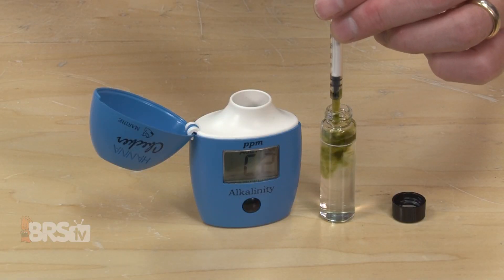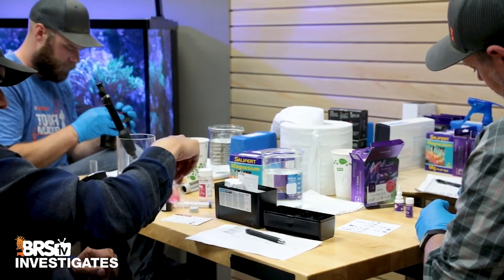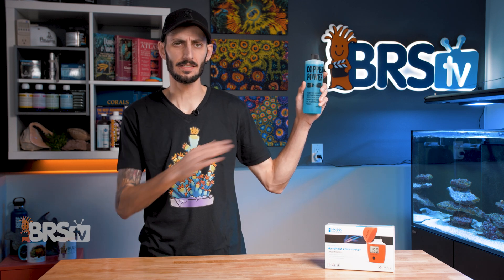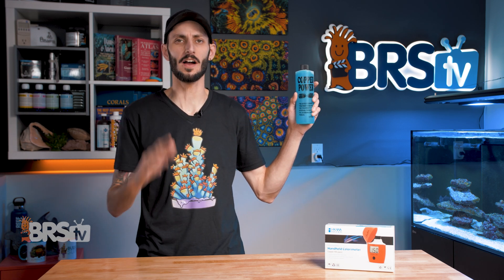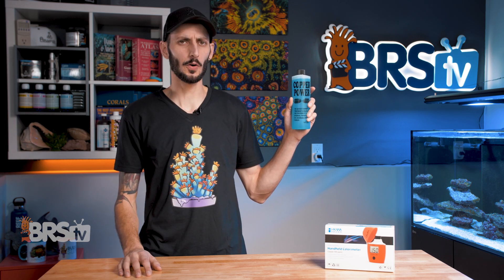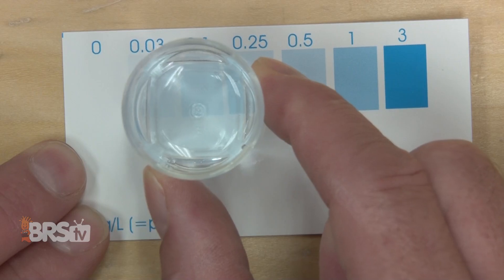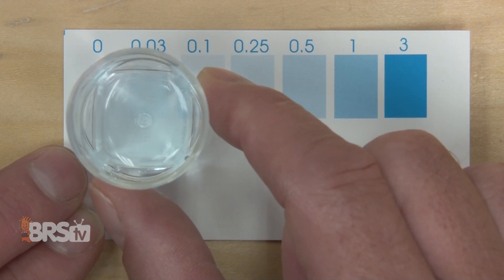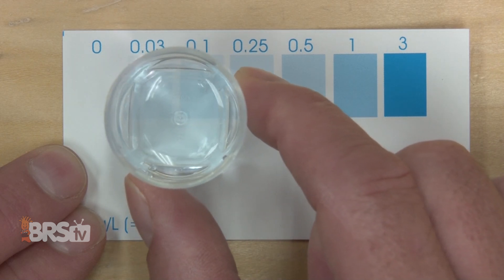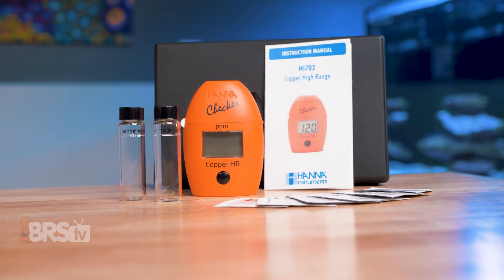Many test kits out there will test for copper levels up to 2.0 ppm, but not past it, which works for some copper medications, but not all. For example, one of the more popular medications, Copper Power, needs to be dosed all the way up to 2.5 ppm to be an effective range for not only parasites, but also fungus. So if you're going to be dosing up to 2.5 ppm, you need a test kit that's going to be able to read past that. And if you're the kind of person who doesn't like those color charts and straining your eyes to try to match up those subtle shades, especially the blues, and you just want an easy-to-read number that you don't need to second guess, then this is a better option for you.